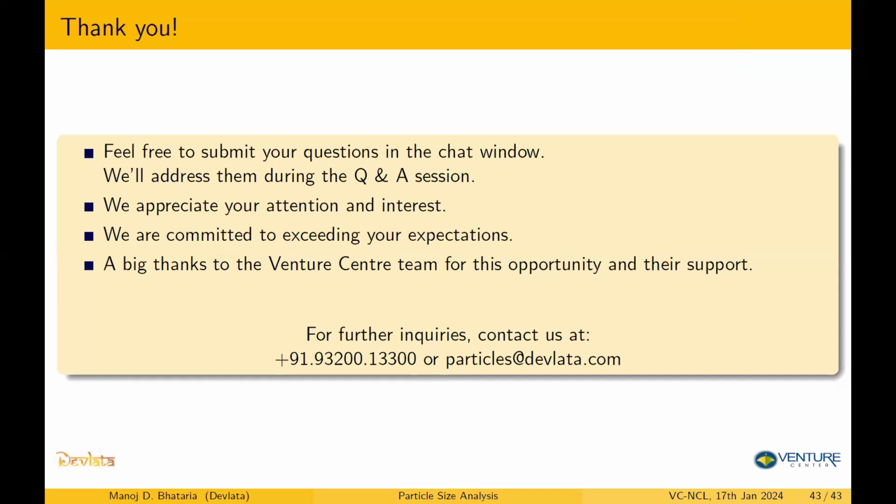Means, sir, each time I have got a different result. Means there is no reproducibility in my sample during DLS analysis. Is it one single angle or different angles? Yes, sir. At one single angle, I have tried many times with 90 degrees. Okay, we need to work on your sample preparation. If you can share some data through email, I can help you identify exactly the issue with your sample.